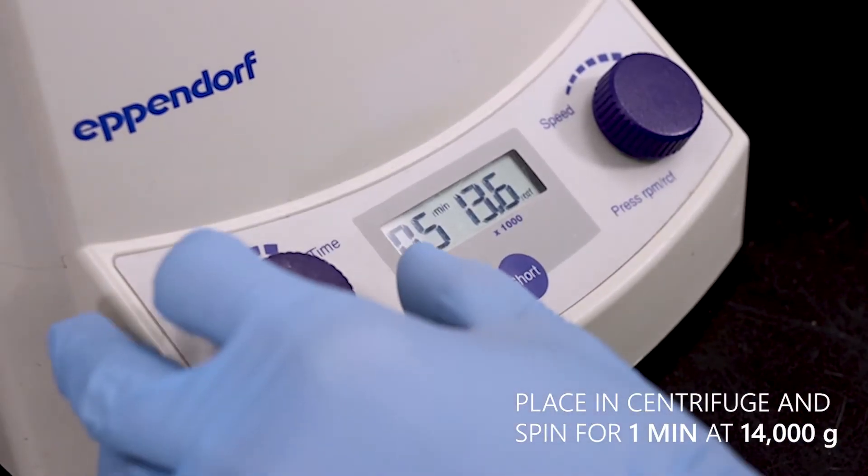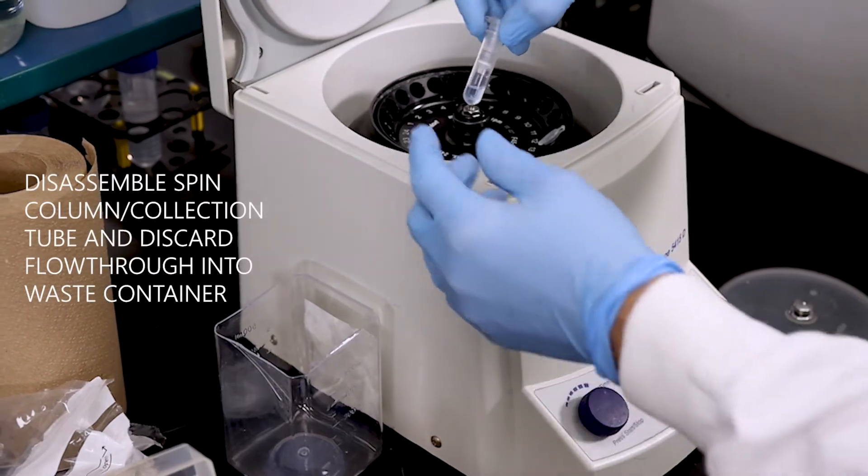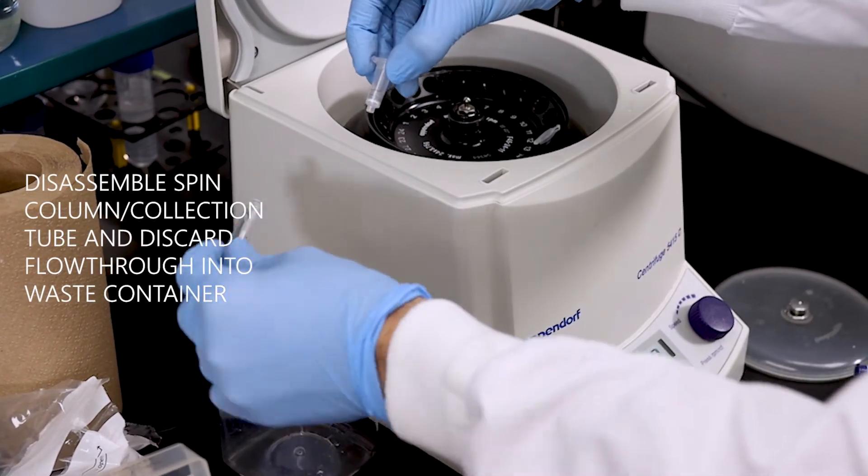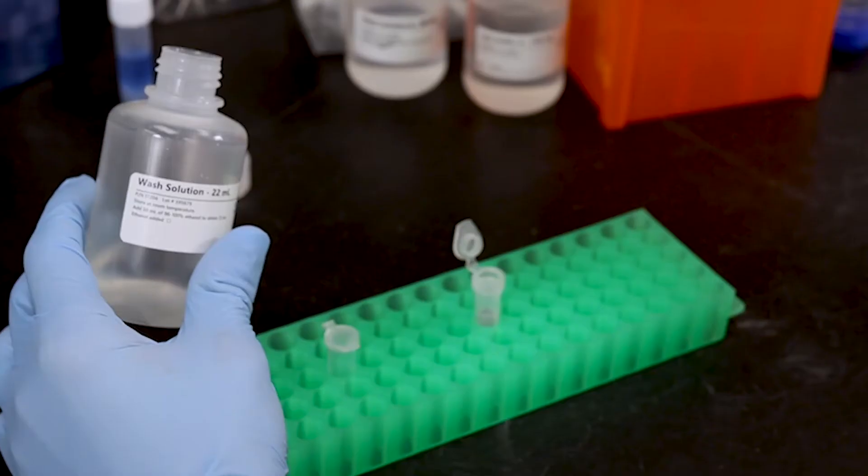Centrifuge the sample for 1 minute at 14,000 G. Discard the flow through into a waste container. Reassemble the spin column and collection tube. Repeat this step until all the lysate has been passed through the spin column.